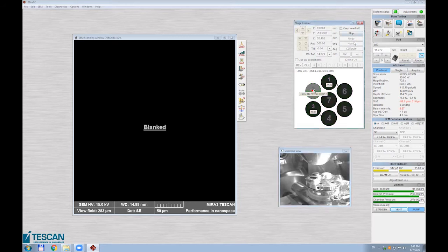So we have our samples in. At the very beginning, I will show you just a few examples. I have zirconium oxide balls there, then some mixture to do EDX, and a mica to have something non-conductive. So it's very fast.